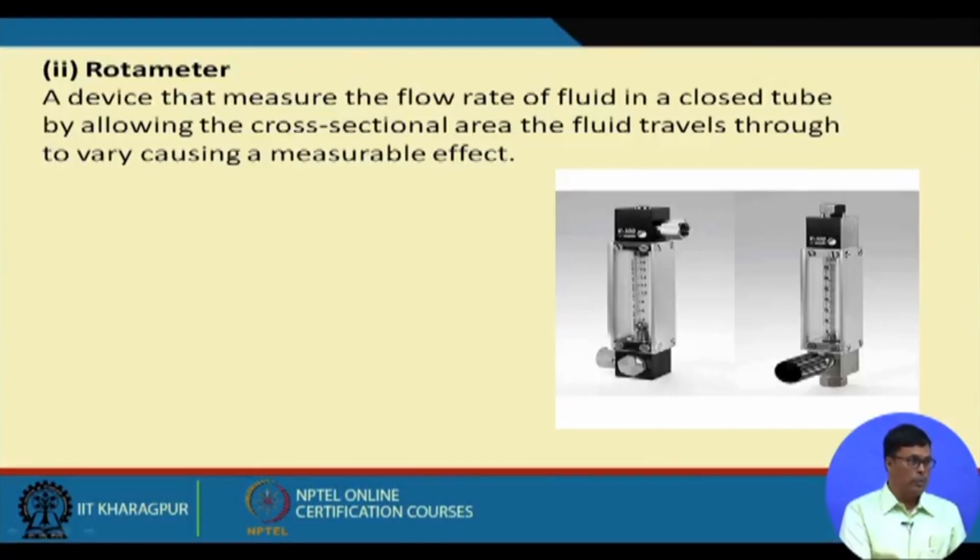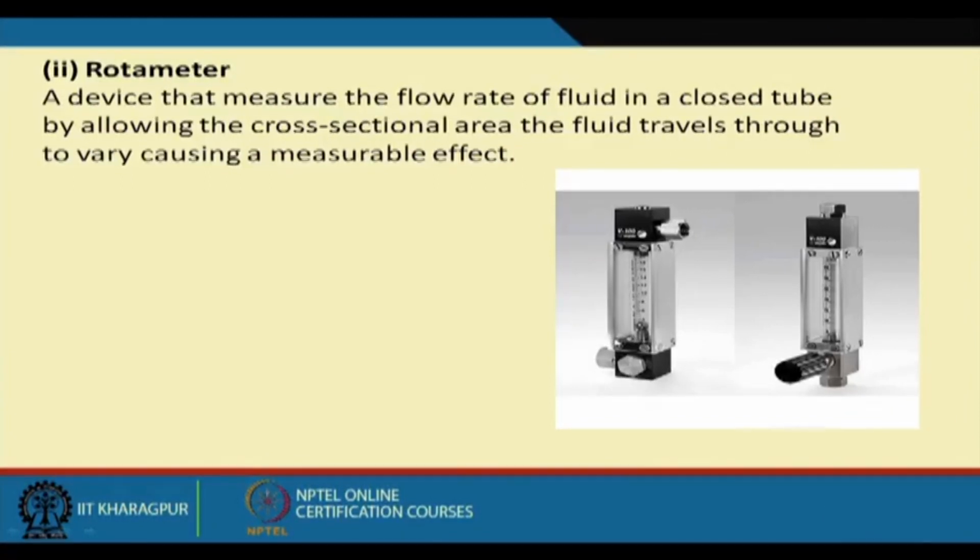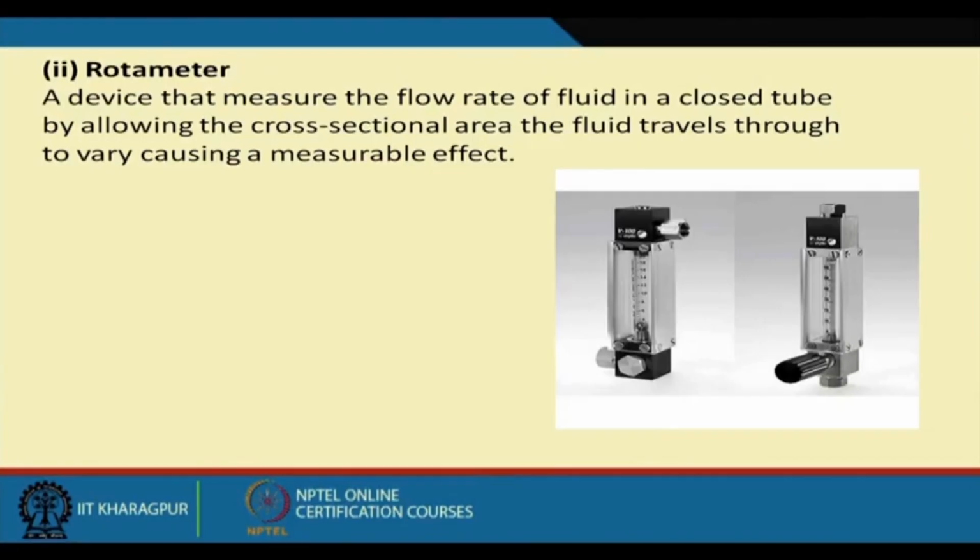Whenever we use any kind of rotameter, first we shall have to remember that we have to calibrate this rotameter, because any kind of meter that we use in any fermentation industry has to be calibrated first. Calibration means finding out whether the reading that the meter is showing is proper or not. How can you calibrate that? With the help of a gas flow meter. With a gas flow meter you can find out the flow rate of air.